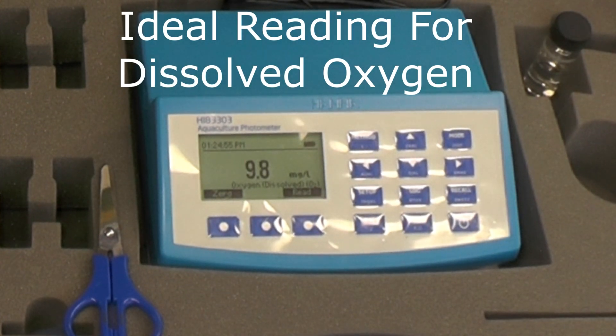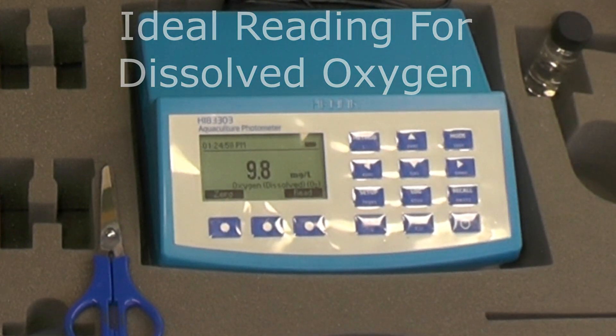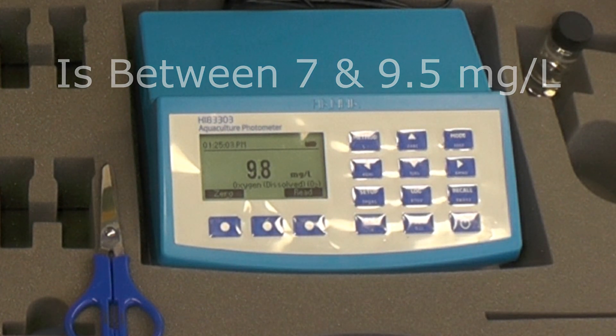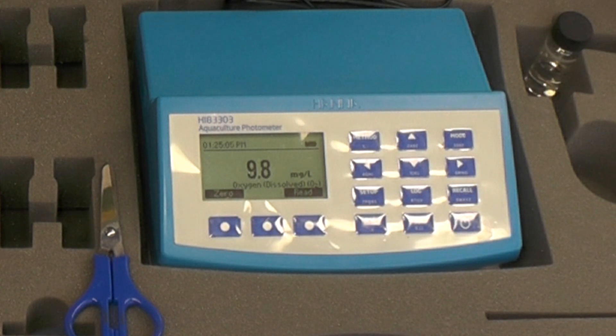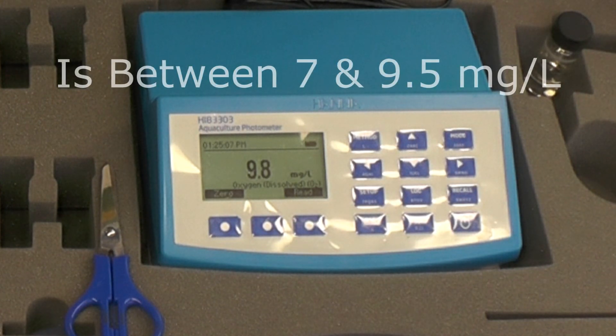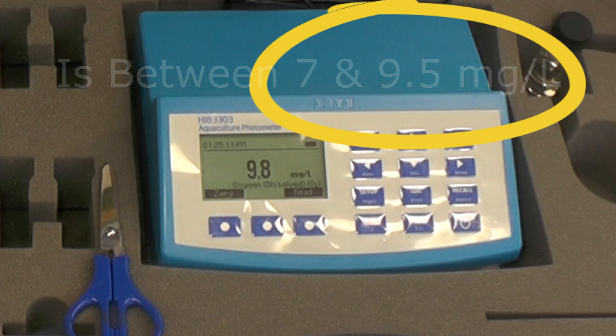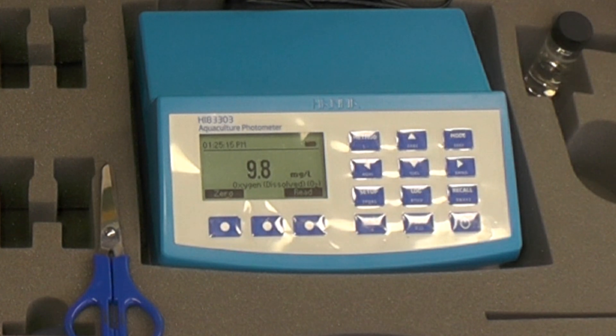The dissolved oxygen is 9.8. The ideal reading of dissolved oxygen in a koi pond should be between 7 and 9 milligrams per litre. This is very crucial in the summer when algae, plants, and fish are using oxygen out of the water. Through the winter it's not too bad, and mine's 9.8, so I'm not going to do anything about that — I'll leave it as it is.